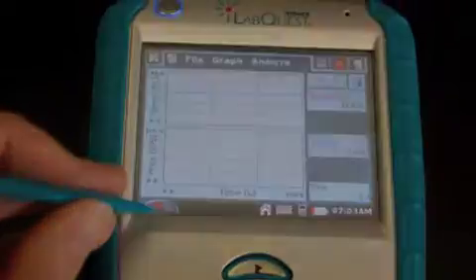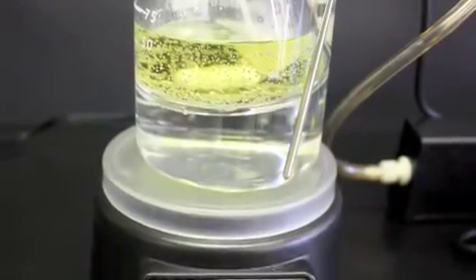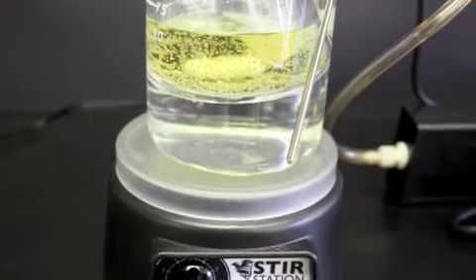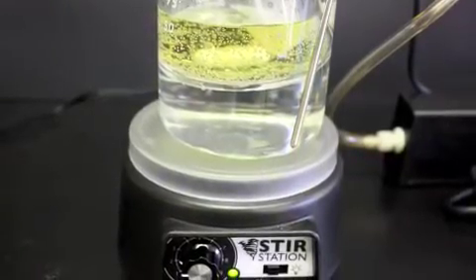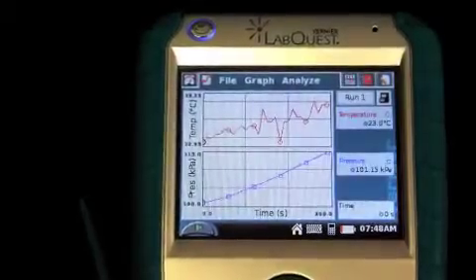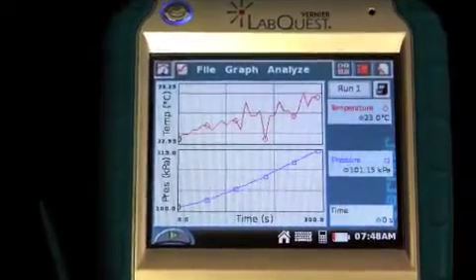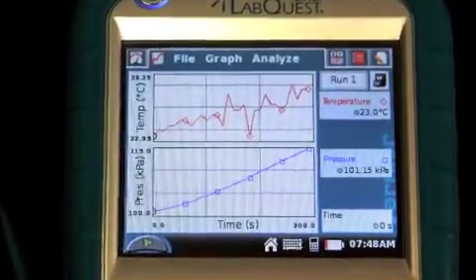Just sit back and wait 5 minutes. You should notice some oxygen being produced in the reaction chamber, and the potassium iodide will start showing a characteristic yellow color. Remember, this should run for 5 minutes and should stop automatically. At the end of the trial, the LabQuest will automatically bring up the graphs of the temperature and the pressure, showing your results for the entire trial.